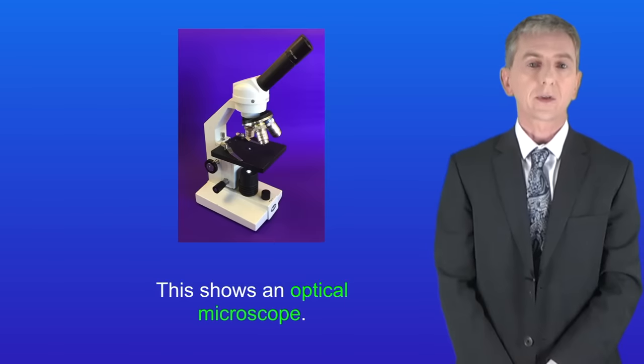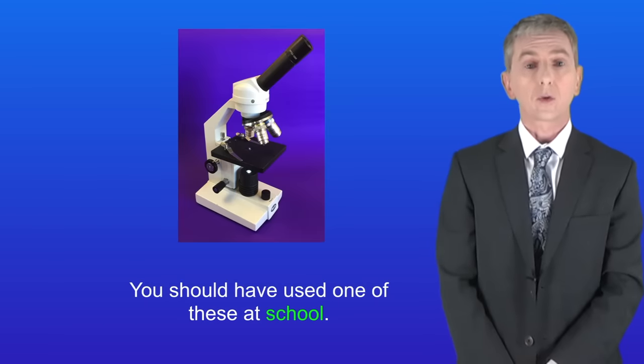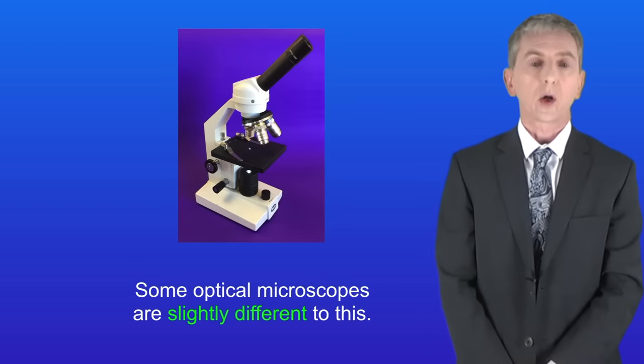I'm showing you here an optical microscope and you should have used one of these at school. Now I should point out that some optical microscopes are slightly different to this and I'll discuss that in a minute.